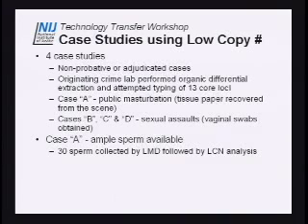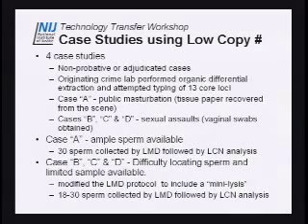So case A, plenty of sperm available, no issue there, but we were trying to still simulate kind of a low copy number scenario. So we collected 30 sperm by laser microdissection. And in the other 3 cases, it was extremely difficult locating even any sperm, and we spent a lot of time trying to find sperm, maybe only a couple on each case. So we were kind of forced to modify our protocol.